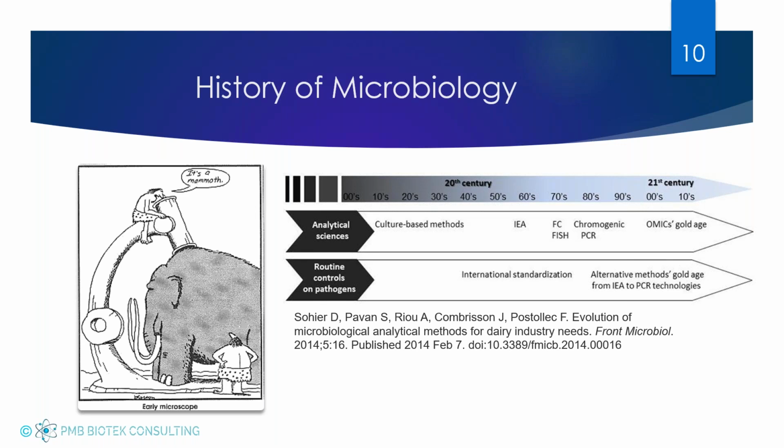And then recently we've moved into what we call the omics age. We're starting to see sequencing, although sequencing is used rarely in the cannabis industry. It's used more for outbreak tracing. But other types of technology, more so coming from the analytical chemistry realm, because laboratories have these technologies, so can they repurpose them from micro and use the same technology to get the same result?